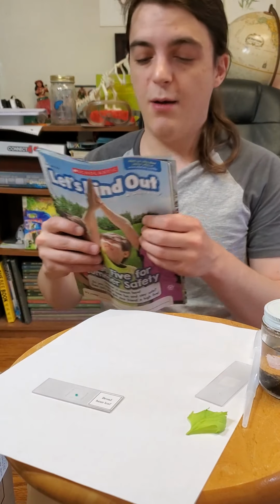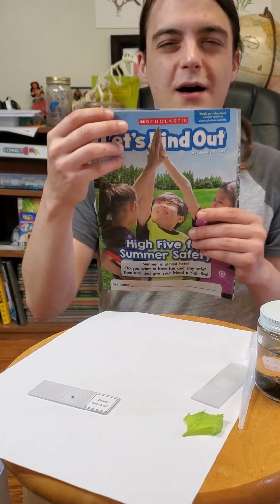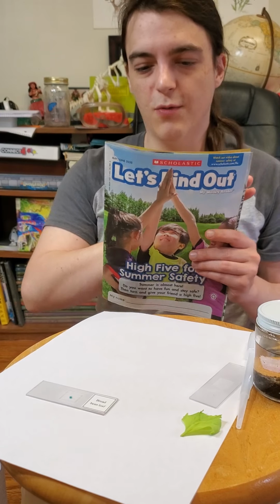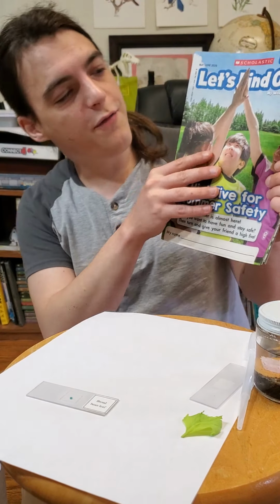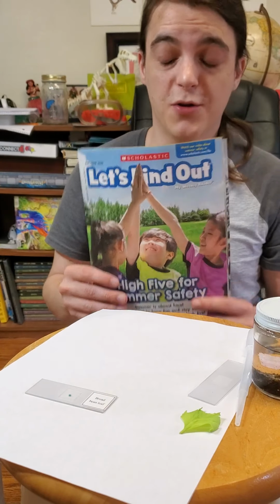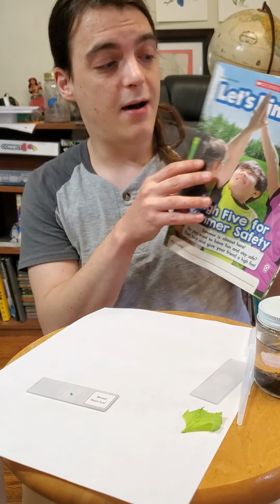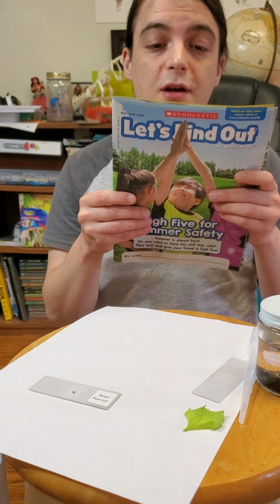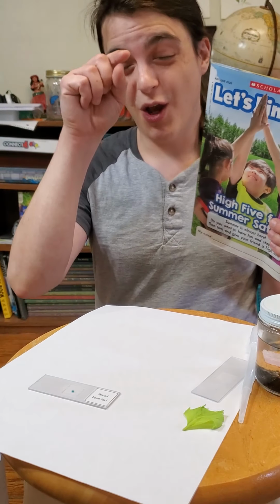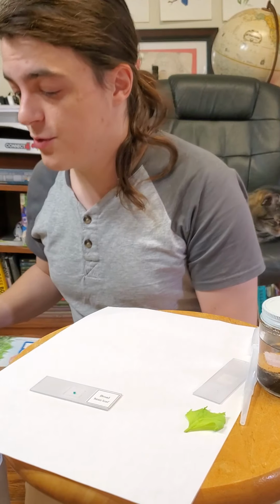And then I want to look at one of these Scholastic, the really papery feeling, not like the magazines that you get that are really smooth. It's kind of the rough paper magazines, because I really like how the ink on these shows up under a microscope. You're going to be astonished because it kind of looks like they painted the ink on here, but you're actually going to find out when we zoom it in that most magazines like this, most comics, are actually a whole bunch of little dots, and we're going to see that really clearly when we zoom in on the microscope.